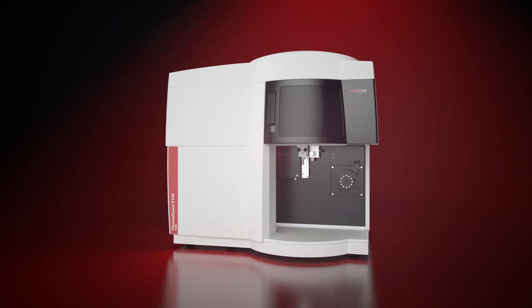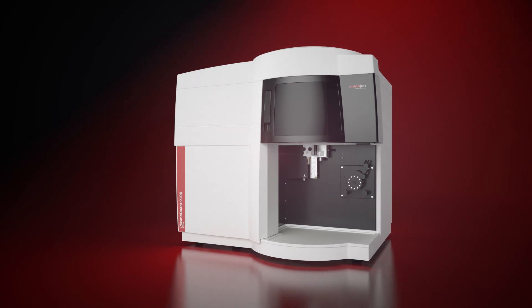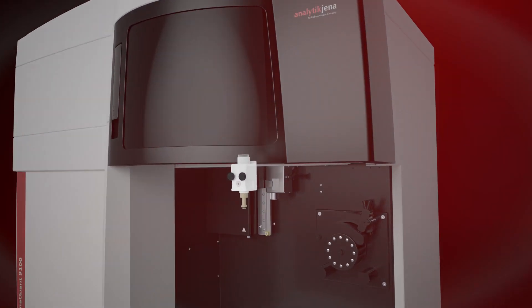Maximum handling comfort, long torch lifetime, and high matrix tolerance for all sample types is provided by the fully demountable vertical torch.